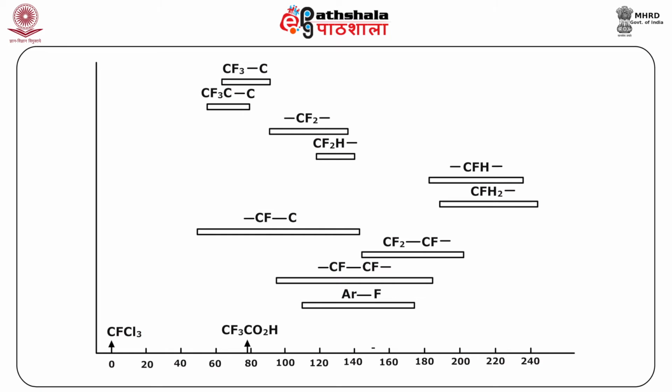The figure shows the chemical shift range for the fluoroorganic compounds. The most commonly encountered signals arising from organofluorine compounds generally lie between 50 to 70 ppm, that is for the trifluorocarbon groups or the CF3 groups, and between 200 to 220 ppm for CH2F groups. The very wide spectral range can cause problems in recording the spectra of 19F NMR, such as poor data resolution and inaccurate integration.